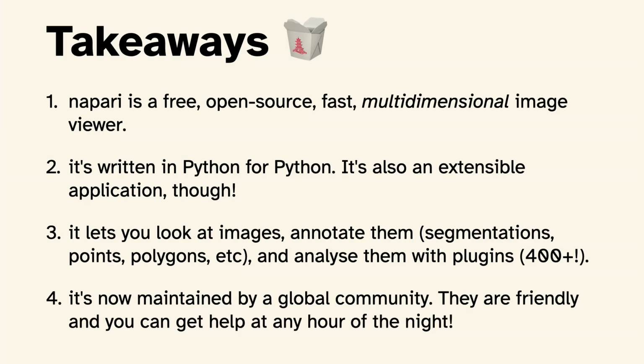So Draga will get into plugins. If you want to distribute your analysis code to someone who's less familiar with Python, you can do that. It lets you look at images and annotate them with things like segmentations, points, polygons, and so on. And then there's a whole bunch of plugins for analysis. That should be 450 now.